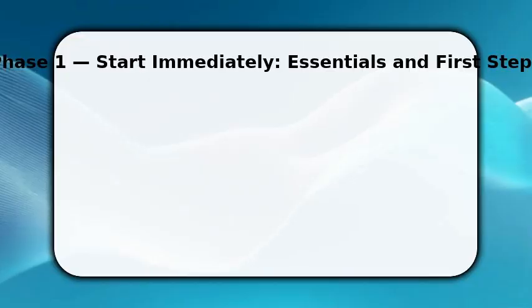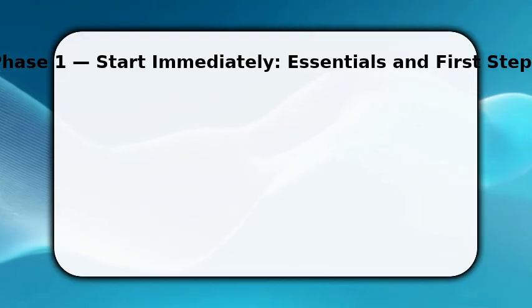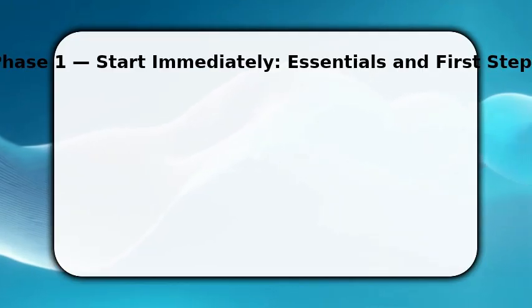Enjoy the video. Start by opening Origin and loading your raw XRD file. You want the 2θ column first and intensity second. Once the file is imported, check delimiters and header rows and convert intensity to counts or percent if needed.